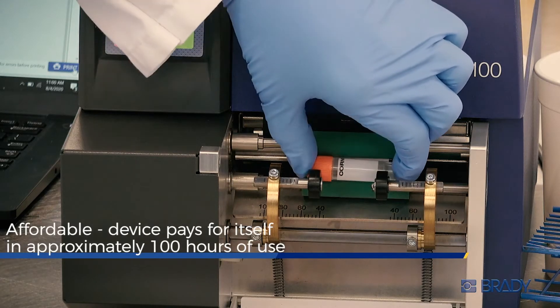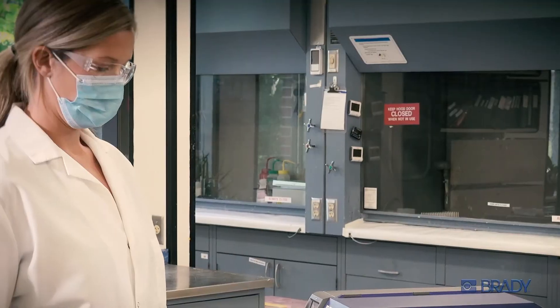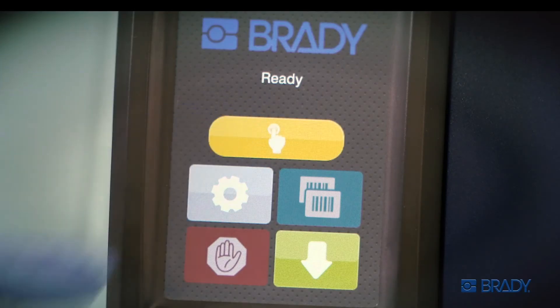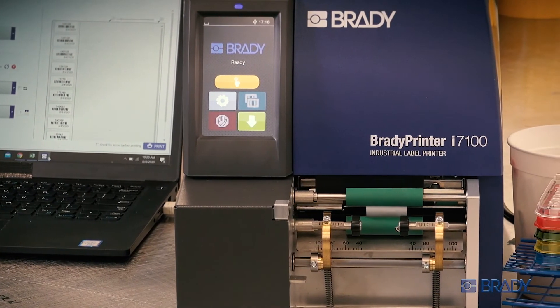And it's affordable, too. No need to spend tens of thousands of dollars if you don't make tens of thousands of labels each day. As your daily volume increases, so should your efficiency. And with the Vial Label Applicator from Brady, now it can.